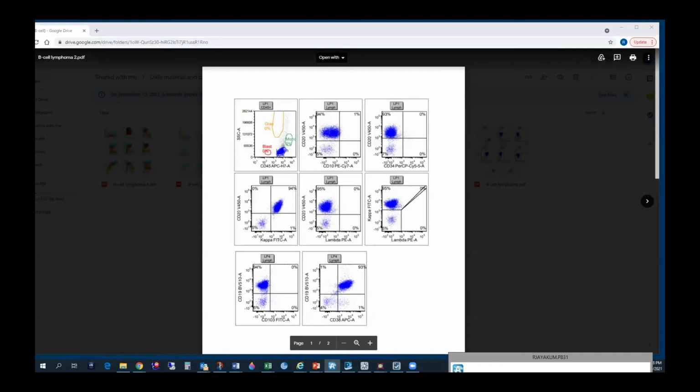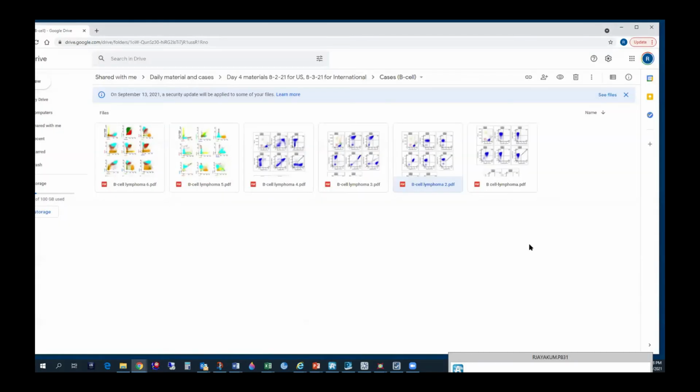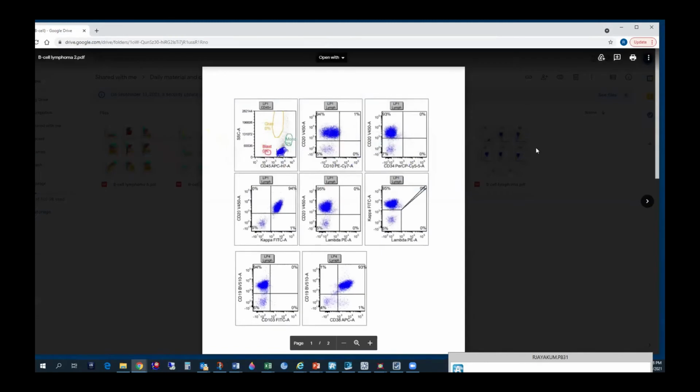That's the point. And we, of course, have to also correlate online. Like I said, I have 4 of them. So I could give you a couple others in between, if you want, let me know. There's a background noise. Yes, there is a background. Yeah, I removed that. Okay.